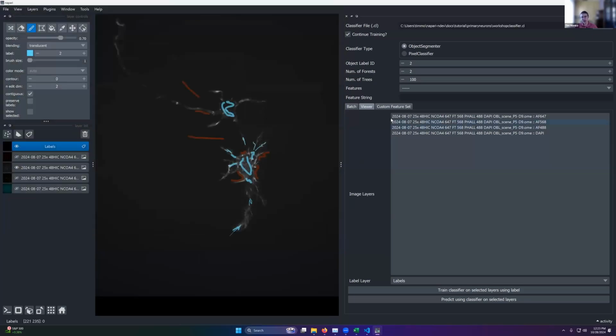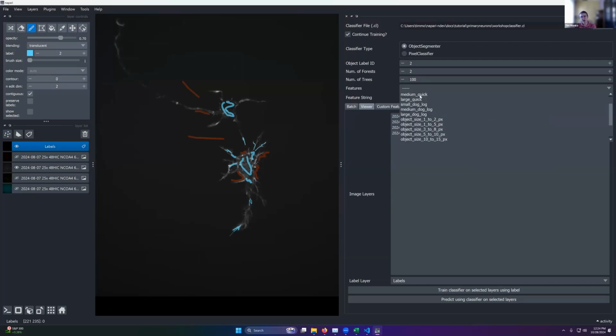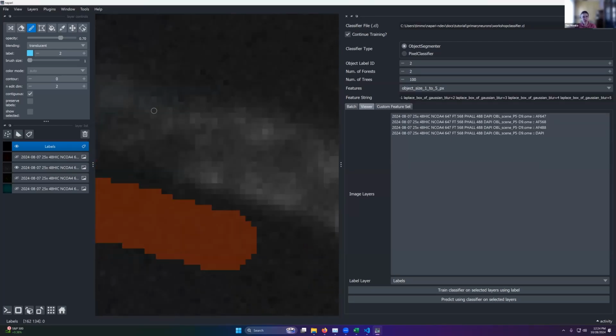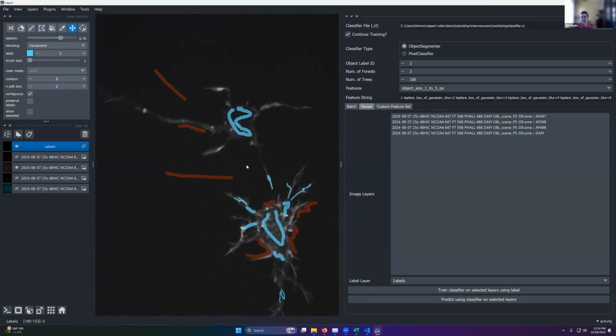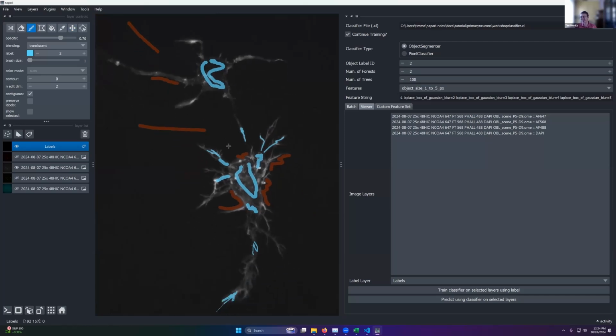So let's say I want to keep this super simple. I want to test, what does it look like if I just say the objects are 3 to 8 pixels, or actually 1 to 5. Why not that? Because we could look at this as more like 15 across. I can assure you that some smaller radii would be helpful. Neurons are goofy. We could talk more about how to do neuron morphology in an email. I think this is one of the most challenging things to do.